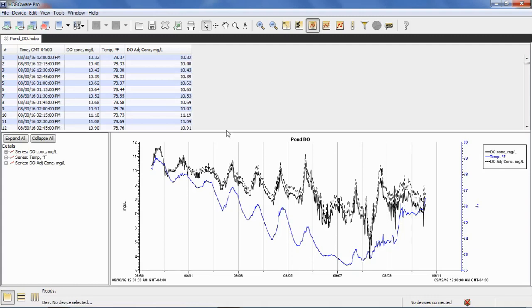So doing that field calibration corrected for that fouling. And when we pulled the logger out, we cleaned it and we put it back in. We left the loggers logging. We'll read them out in another couple of months to see how our long-term data looks. But for right now, this is just an interim readout, to make sure everything's working okay.